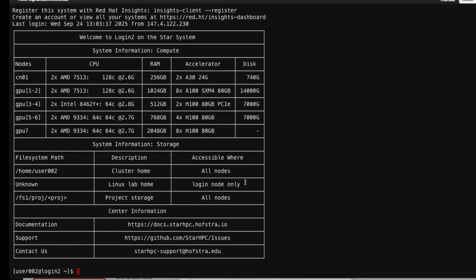So it's the only data that FastQ. Yeah, the only files we're going to use are those two FastQ files. Yes. I will send it on Zoom. Oh, thank you for doing that. Okay, that way people can at least play with it. But I think that if the people on Zoom already have a cluster network account, they should work. But if they don't, then they can at least look at the files. Yes, they have Unix. Yeah, if you have Unix, you should be able to do it.